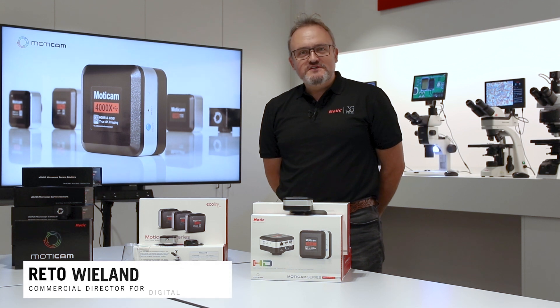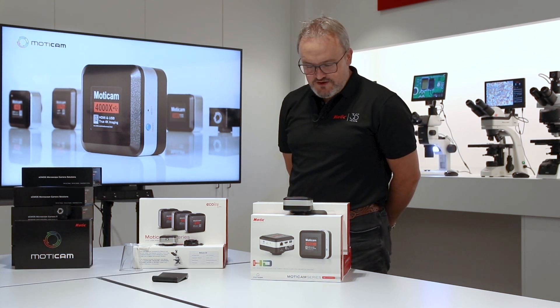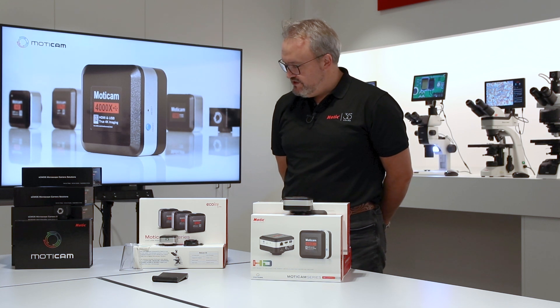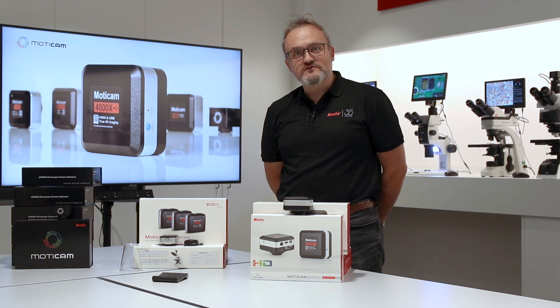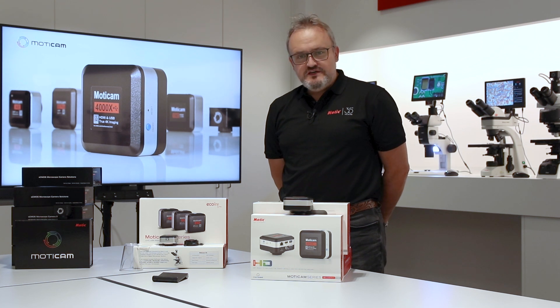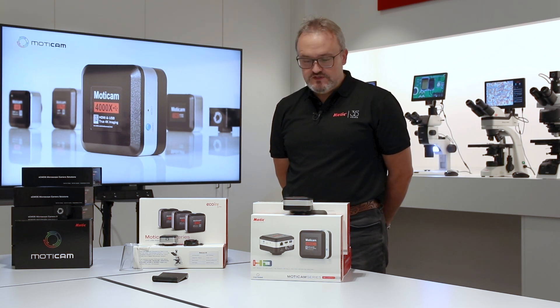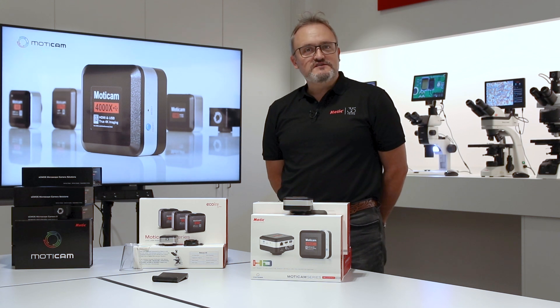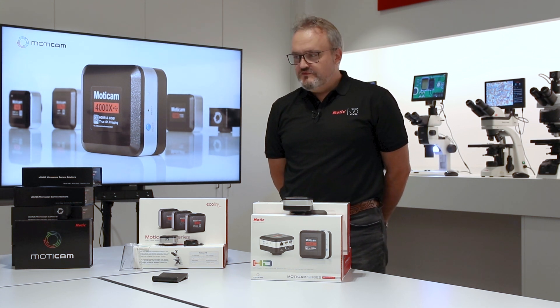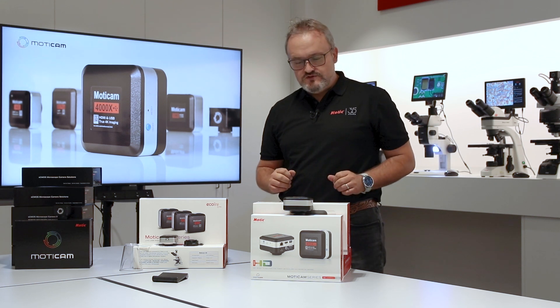Hello and welcome to Motic here in sunny Barcelona in Europe. What I'd like to do today is to show you the three different levels of Moticams that we have on offer. Motic has been making and selling attachable microscopy cameras since 2001, and we have always had three different levels of cameras that we offer depending on your use.